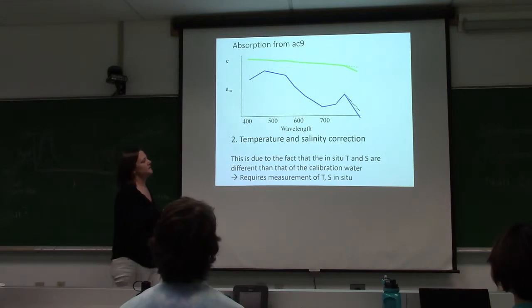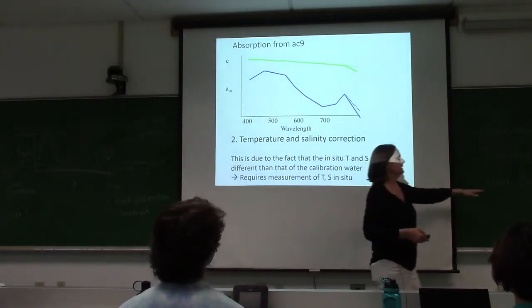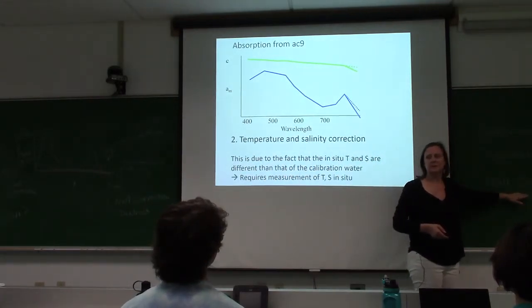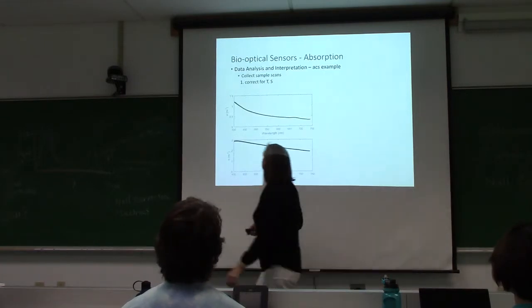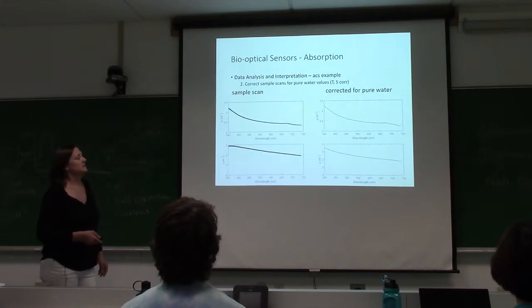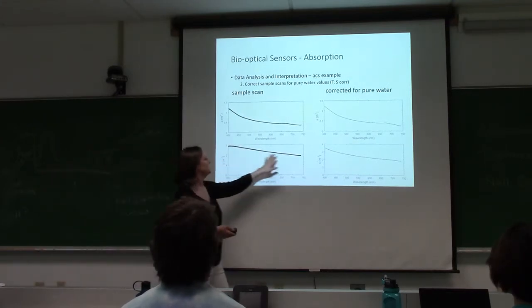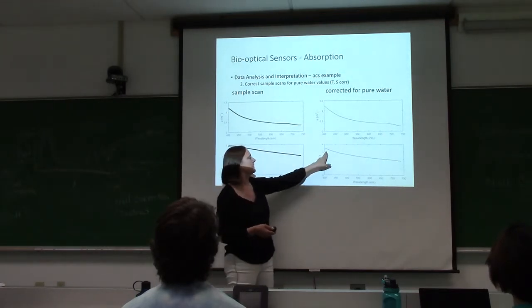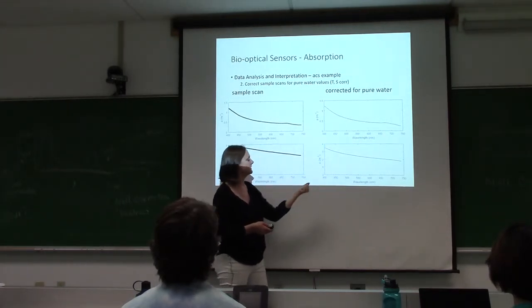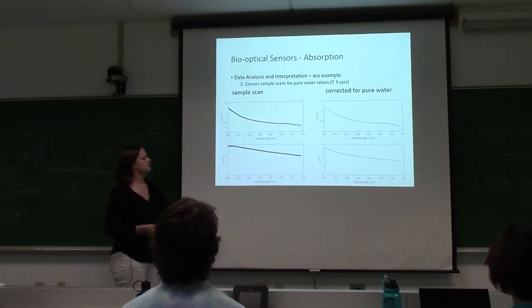And we'll see that the reason why this is really, really critical is because of the null correction. We are back to the null correction. All right, so here's the ACS. There's the correction for pure water. Fantastically different. You do notice that because we had a big negative calibration, now our value is much higher. By a lot, 0.5, so pure water correction is really important.